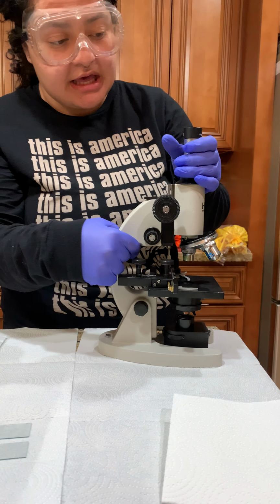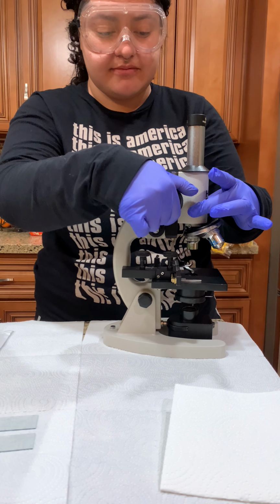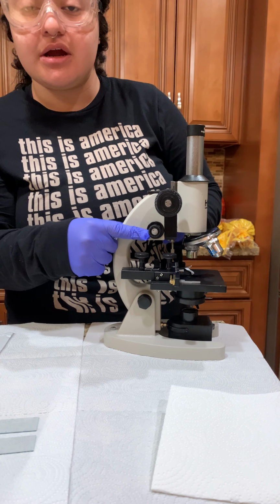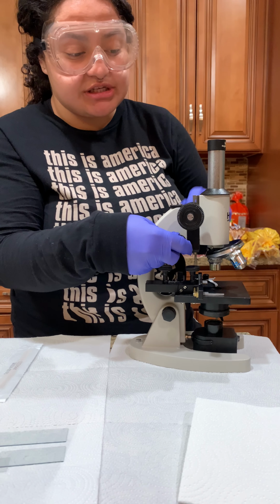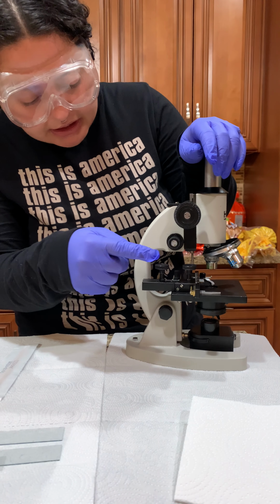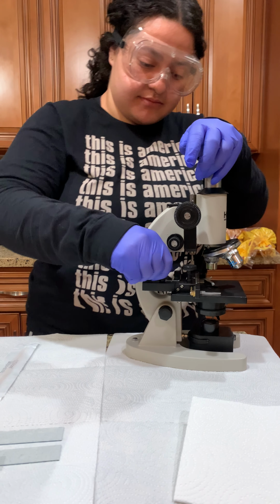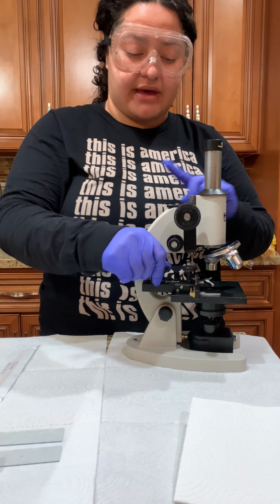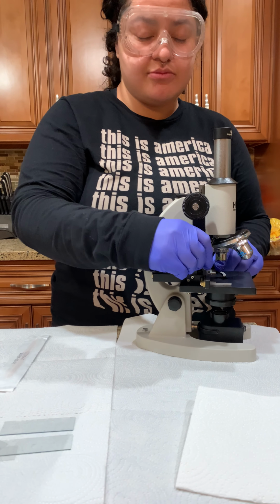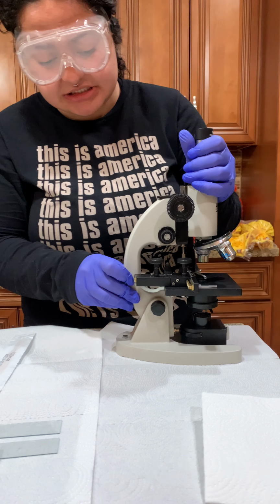With the side view, I talked about the coarse focus knob. It's the big one to help move the objective lenses. And then when you fix that, you have your fine focus knob, which helps focus the image more. Then right here, this back one is a transverse knob. It moves the slide forward and back. As you can see, this is moving. And then the one up here is a longitudinal knob, which moves the slide side to side. So you can use that to adjust your slide into the lens so you can properly see it.